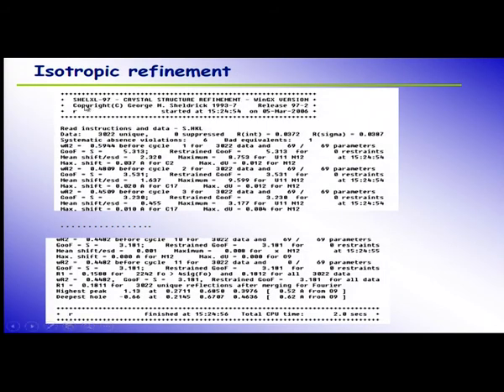So, this is the output of the least square program called SHELXL. Here what you have to see is how many reflections there are. It will give you 2 R factors. This final R factor is R1. Every cycle it gives the R factor known as WR2. This is known as the weighted R factor. We will deal with R factors later. Usually the WR2 will be thrice that of R1. So, do not confuse. What you are going to see now is the output of the least square refinement program.